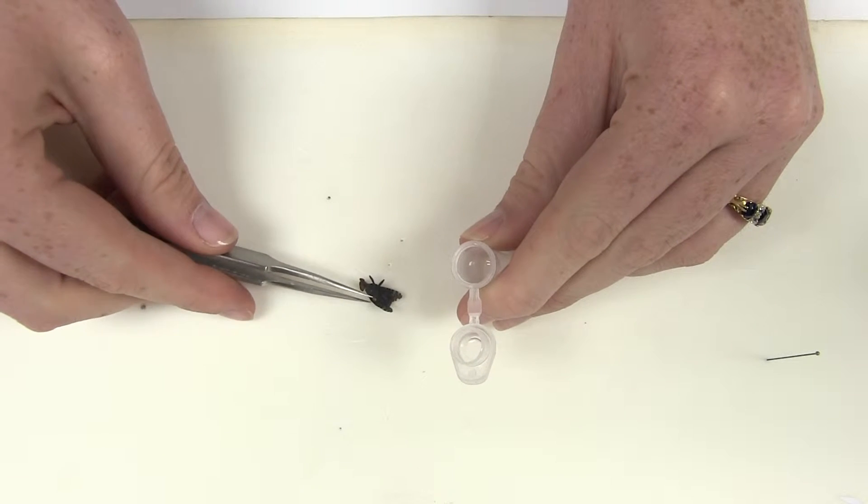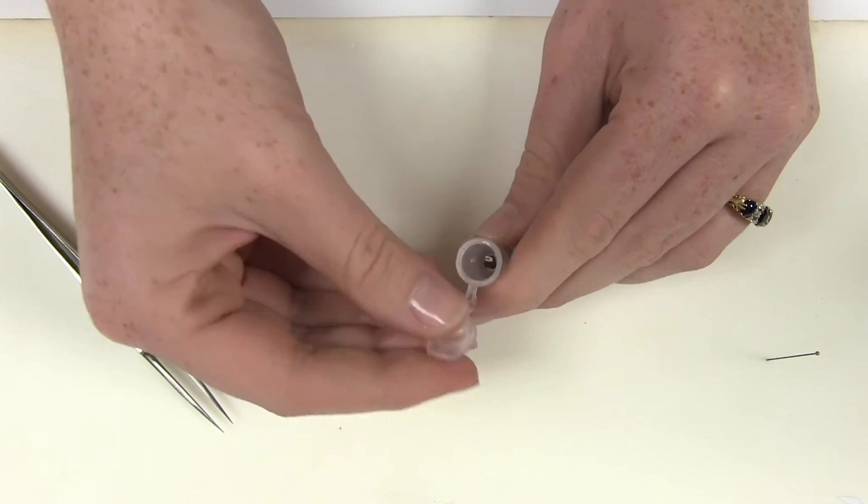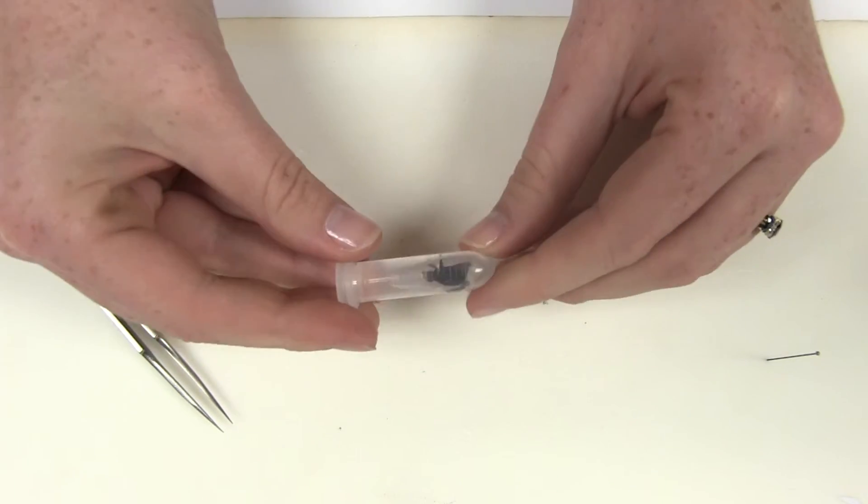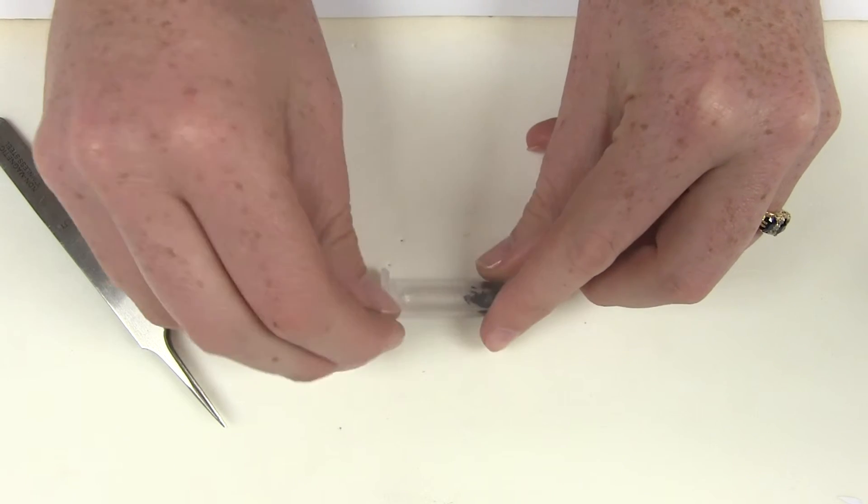Place your insect in the tube and, if necessary, fill the tube with some more fluid so that the insect is completely submerged. Use a straight pin or an insect pin to pin the tube in place.